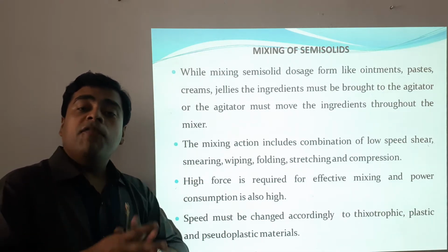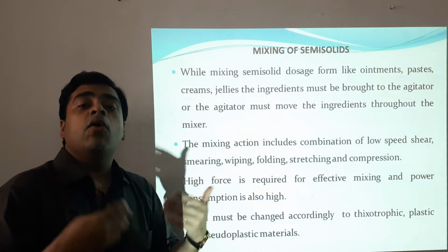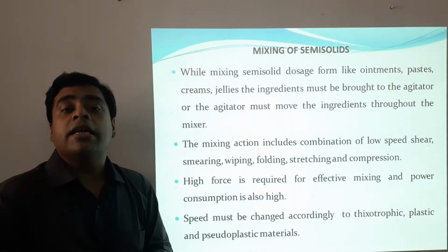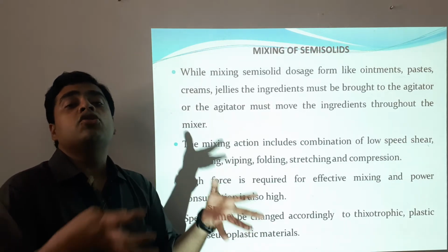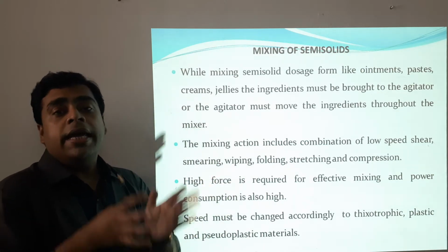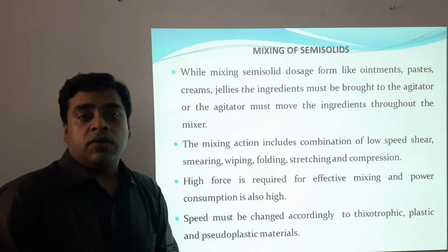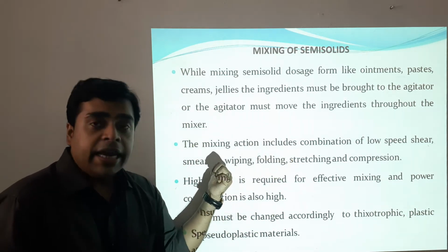Because a number of ingredients are being used, and the maximum ingredients, like the ointment bases, are in semi-solid forms while all the powdered ingredients are in solid forms, mixing the semi-solid ingredients with the solid ingredients to form a semi-solid dosage form includes a variety of combinations of actions, that is low speed shear, smearing, wiping.